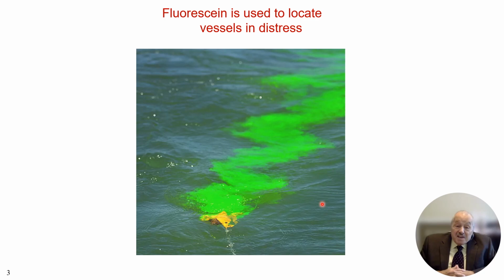Drop it in the ocean, and you see this bright green fluorescence. There's a lesson to be learned even from this, which is that the bright green fluorescence appears on top of a dark background because light is coming back immediately from this top layer of fluorescein, but the rest of the light is going deeper into the sea, and you don't see it.